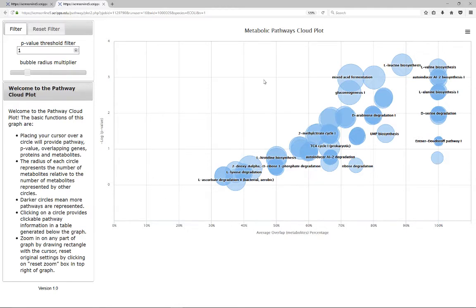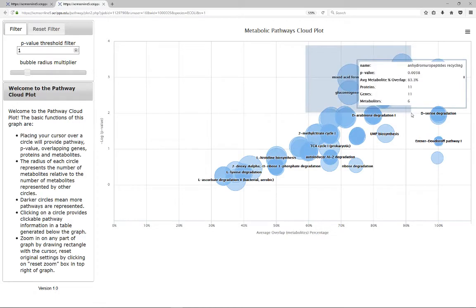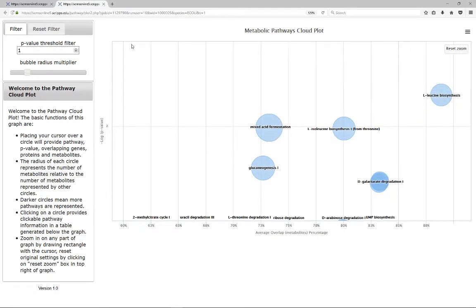The interactive pathway cloud plot allows users to zoom in on any part of the plot by drawing a rectangle with a cursor. Users can reset to the original plot by clicking on Reset Zoom box in the top right of the graph.